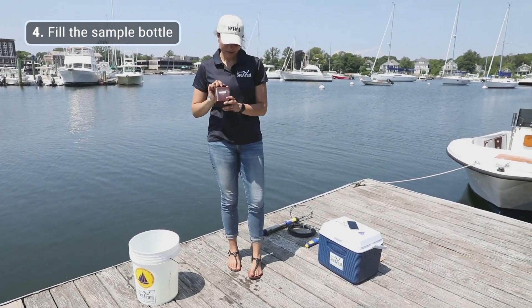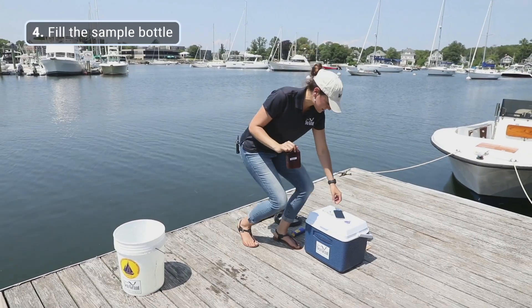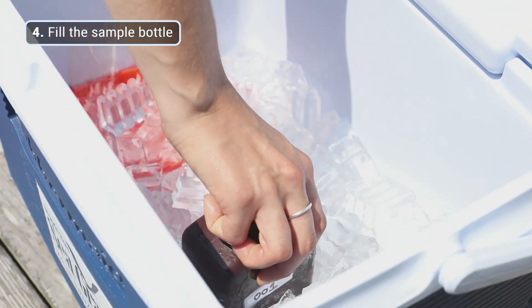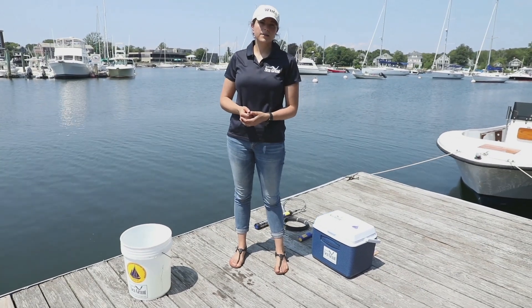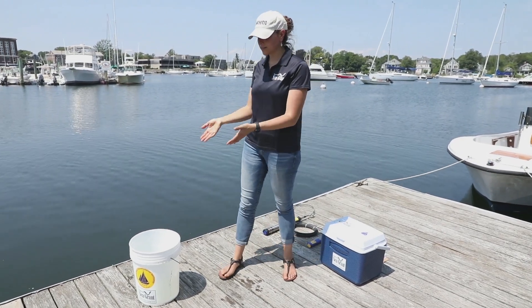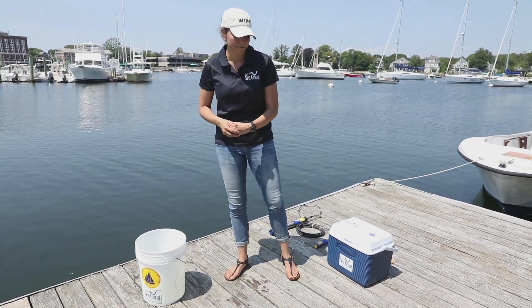Then we're going to take our water sample and put it immediately on ice in a cooler. If you're collecting samples at low tide or high tide, which would have duplicate samples, you would collect that duplicate sample out of the same bucket that you've already collected your first sample from.